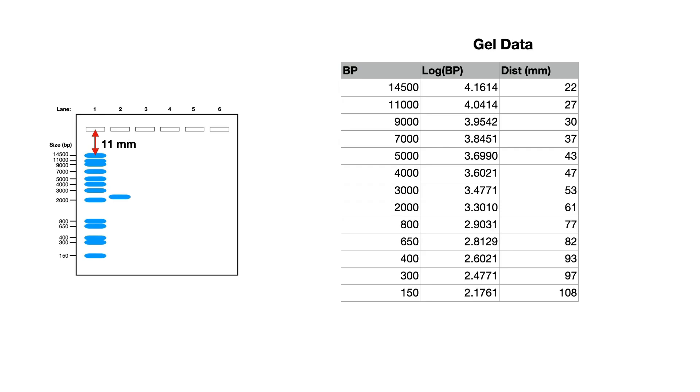And when we measure the distances on the smaller gel, that first band has moved 11 millimeters and the rest 14, 15, 19 and so on with the unknown which had originally moved 58 millimeters now having moved 29 millimeters.